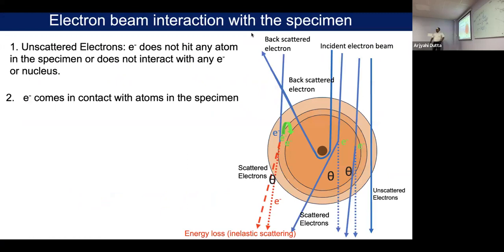Yes. So how much time does it take to damage? Like, what is the time duration for an electron beam to damage the sample? Sometimes it is very difficult to tell how much time it will take. Generally, just as an example, in material science they are using an electron dose of 200, 300, 400 electrons per angstrom square per second. For a biological cell sample, we are using only 30 electrons per angstrom square, in 10 seconds.